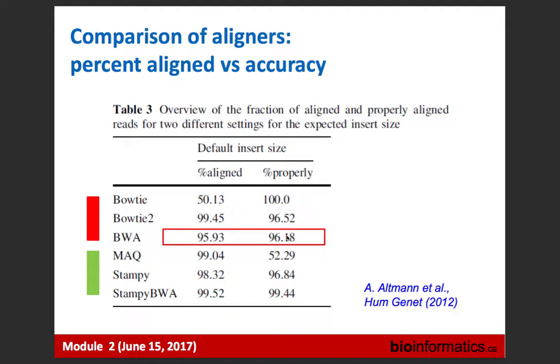Now, after alignment, something to mention for you. After alignment, there are different flavors, or different decisions were taken by people who wrote those aligners. For example, some aligners will not write in the alignment file those reads which will not align. They dump them somewhere else or just forget about them. Some aligners will keep all reads. And it's a big difference for us.